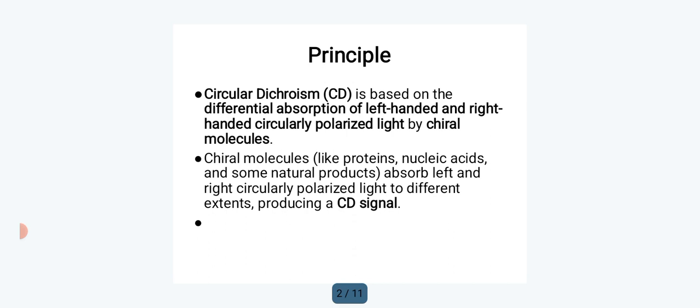That is, they absorb left and right circularly polarized light to different extents, producing a CD signal.